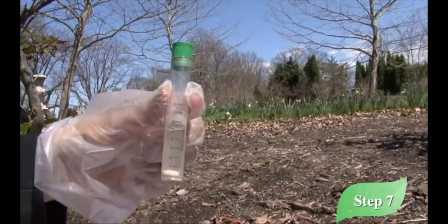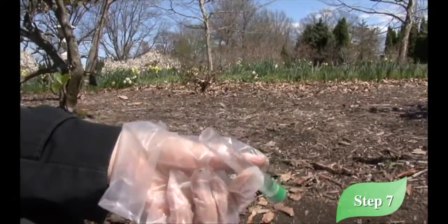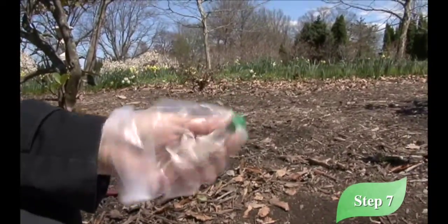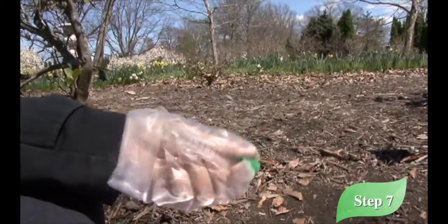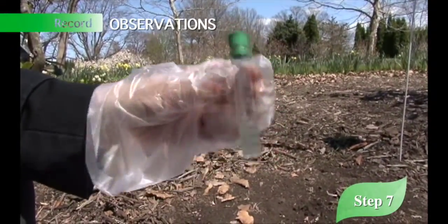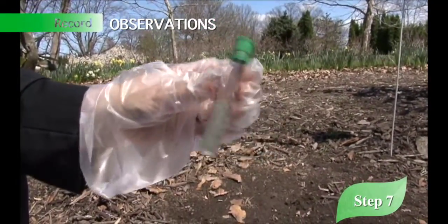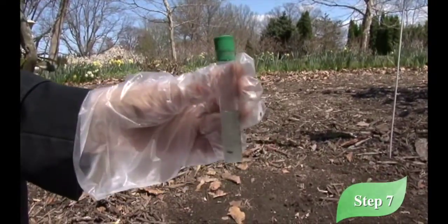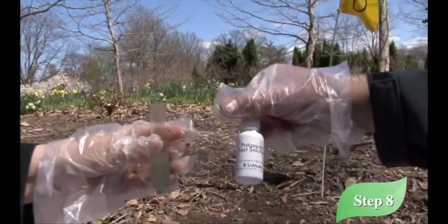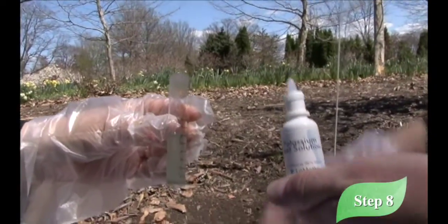And gently, in step 7, start dissolving. The purplish color will appear soon. All right, it's turning a little bit like a purple color, so we need to record that on step 7. Okay. And then we're going to start on step 8, which is you're going to add potassium solution, 2 drops at a time, and we have to keep the count. So go ahead and open it. Add 2 drops at a time.